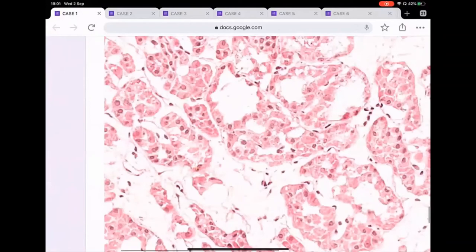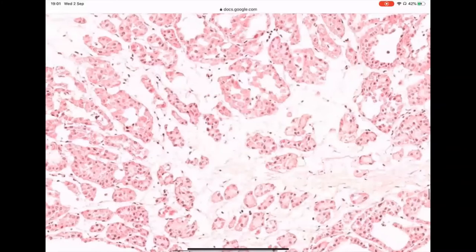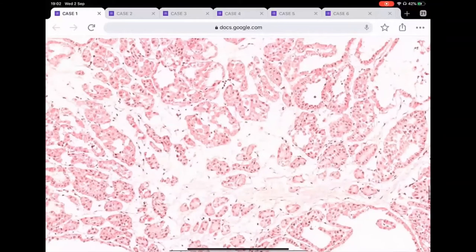So now, based on what we saw in this case, what are you going to do? Remember, we have three situations. Now this kidney: there are two patients lying down in the anesthetic room, the recipient and the donor. And this is the donor kidney, and it has got this lesion. And they are asking you now, what are you going to do? Are you going to give me a benign diagnosis, a malignant diagnosis, an uncertain diagnosis with differential, or are you going to defer, which means ultimately you will defer? So this is what we will be going through.